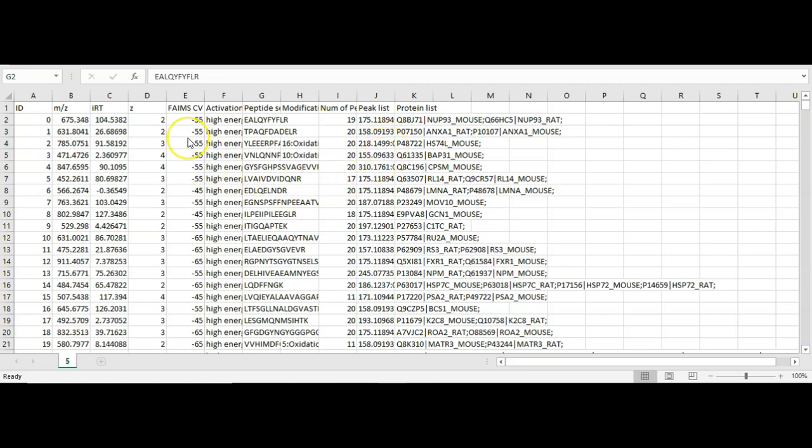Also, if you're using ion mobility data, it will read in the ion mobility details, in this case, the CV values.